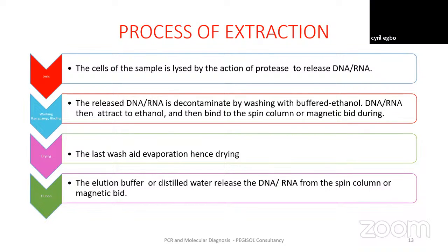Then all the process of DNA extraction follows this.